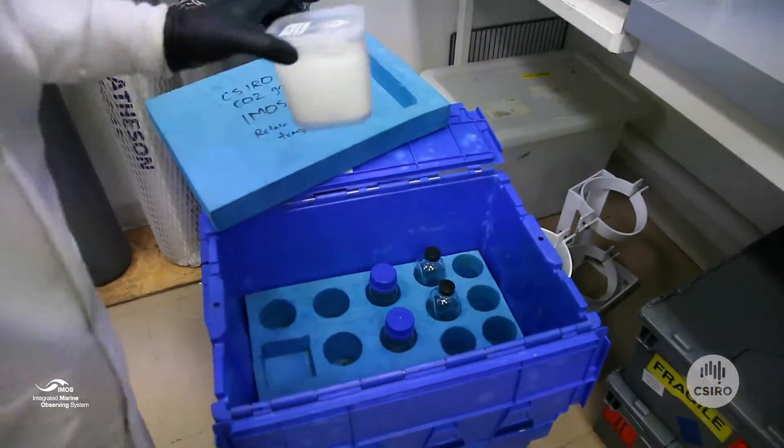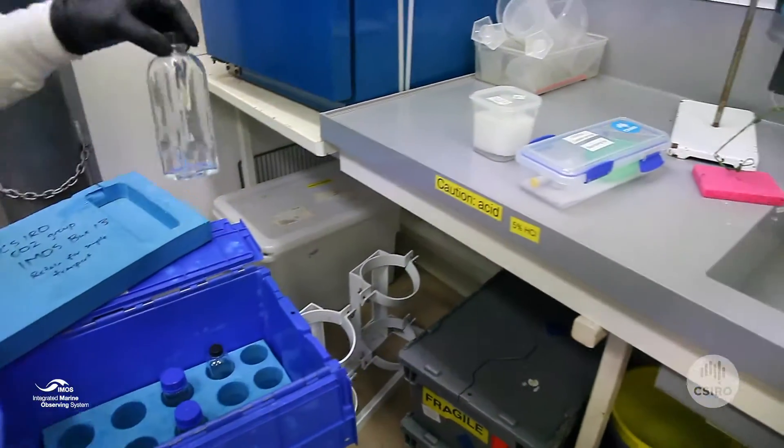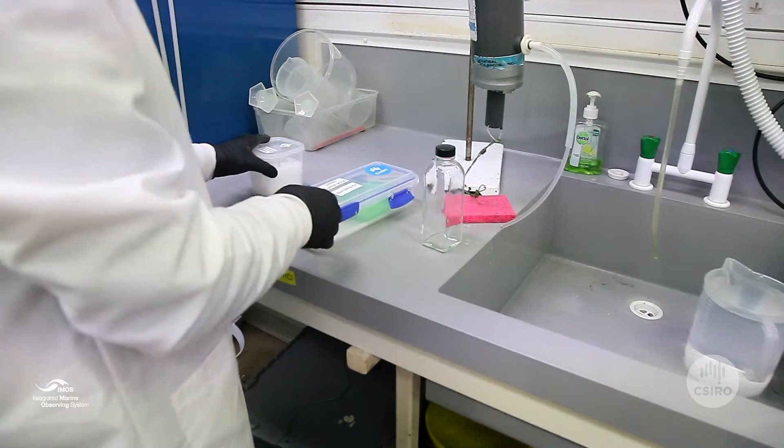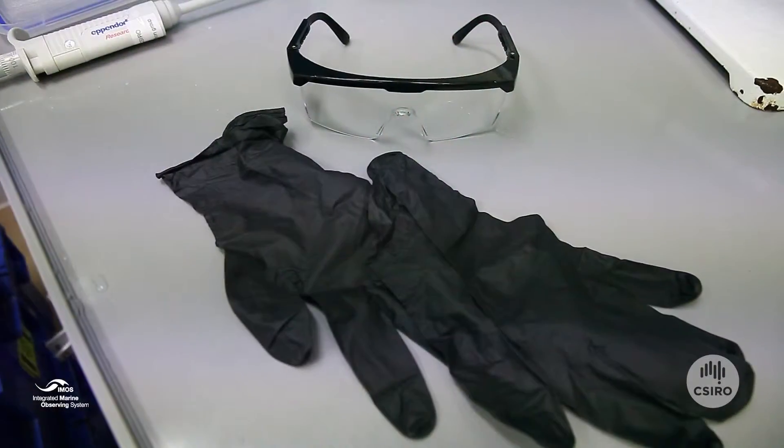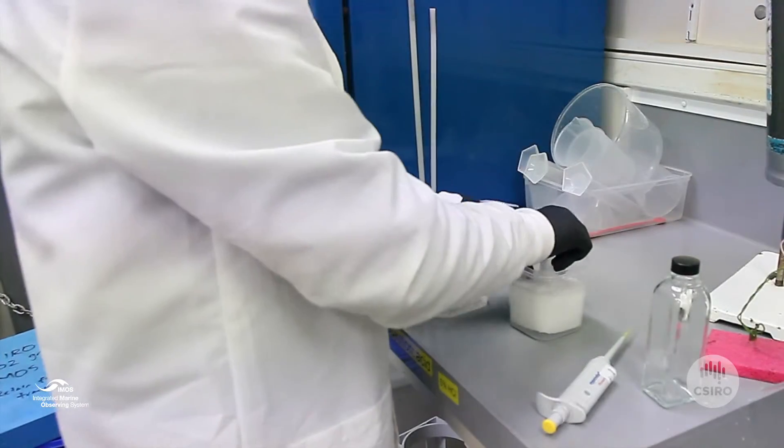I'm going to describe taking carbon samples from seawater. The blue box provided has two kinds of bottles and mercuric chloride. Please be careful with the mercuric chloride solution—it is poisonous.